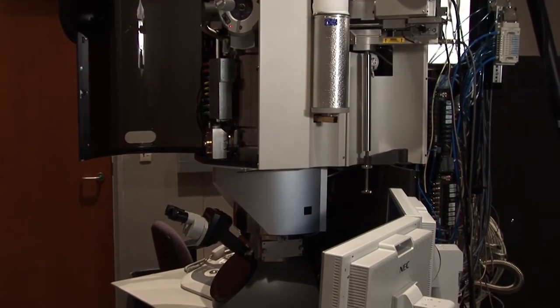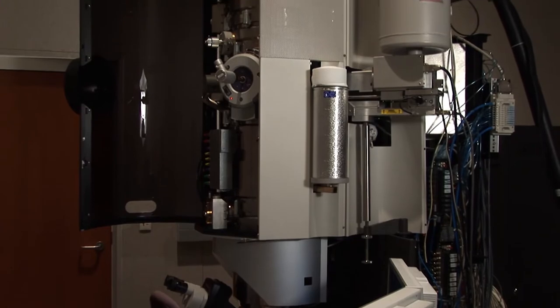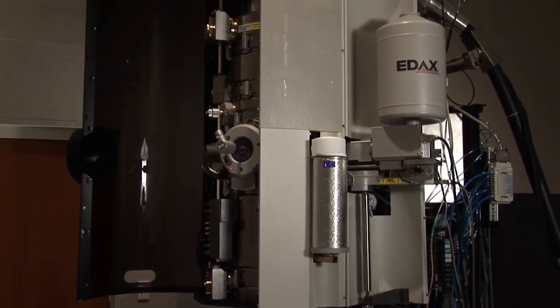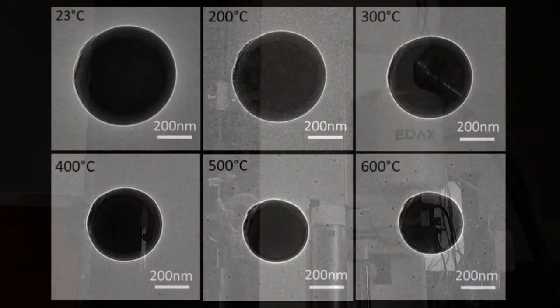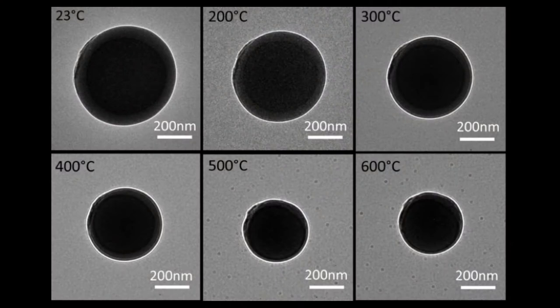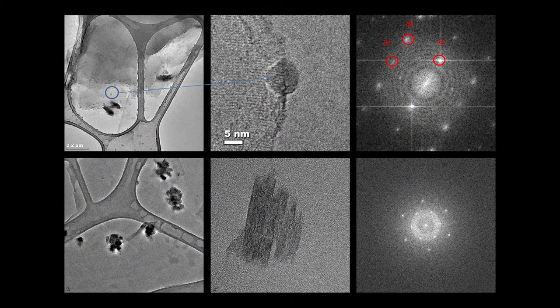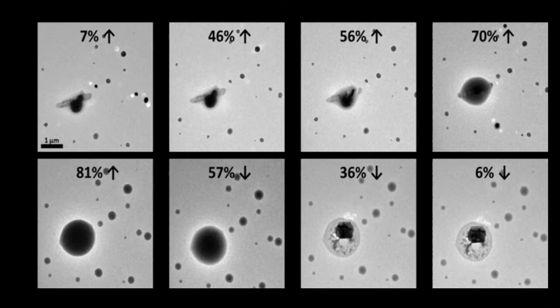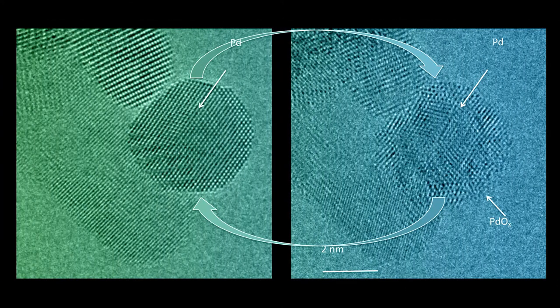It uses high energy electrons to image and analyze materials down to atomic level. We can look at different kinds of samples including biological samples, soil minerals, aerosol materials, and catalytic and battery materials.